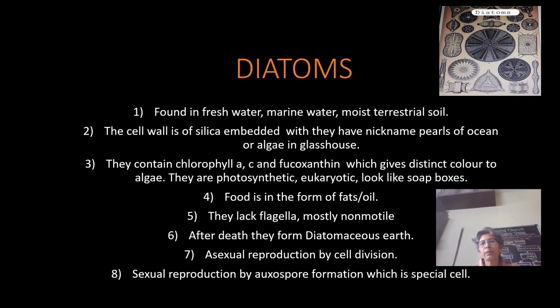After death they form diatomaceous earth. Asexual reproduction is by cell division, and sexual reproduction is by auxospore formation, which are special cells in diatoms.